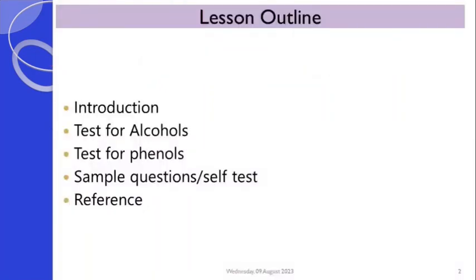In this lesson, we're looking at how we can test for alcohols and phenols. As we go towards the end of the lesson, we'll look at some sample questions, or we test ourselves with some questions. As usual, I'll provide you with references to help you for further studying of the topic for today.